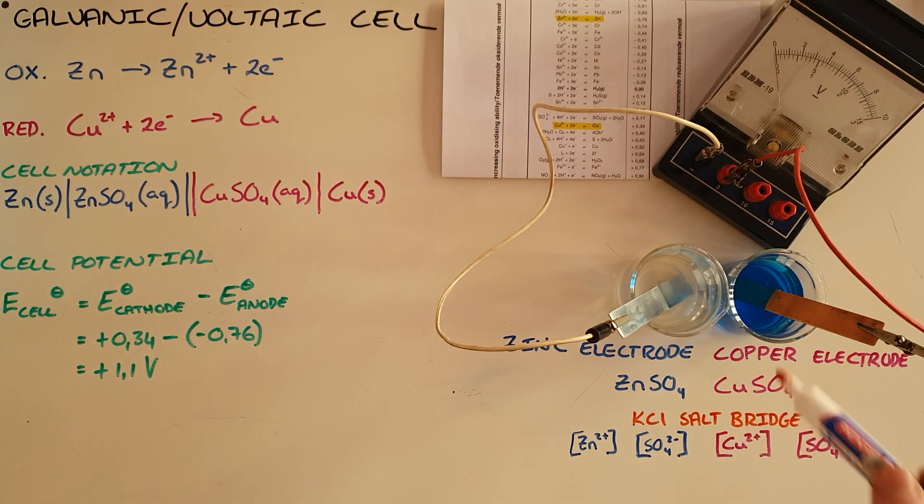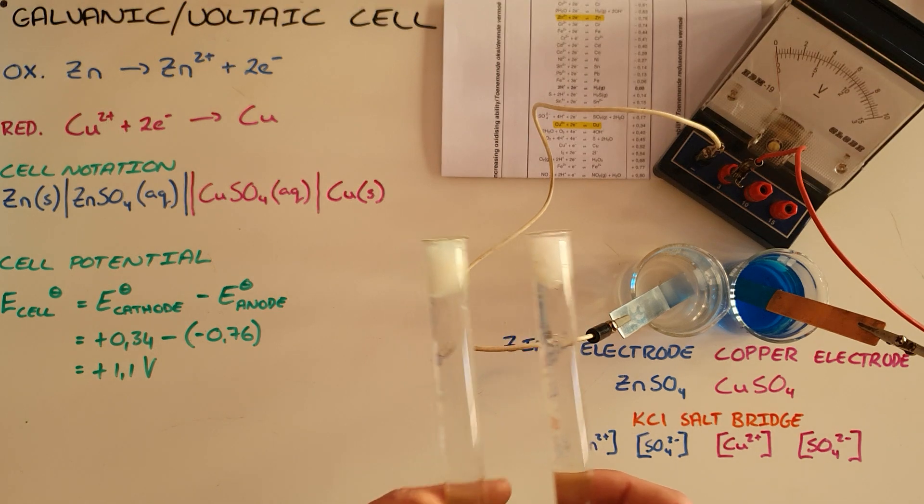And so what we can see here is once that is set up, I have connected this to a voltmeter to detect the potential difference. All that remains to do is to complete the circuit and that is by using a potassium chloride salt bridge that has been prepared in this U-tube here.